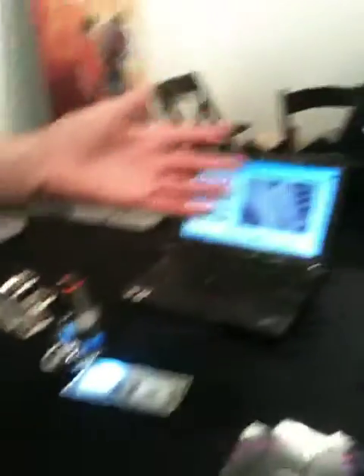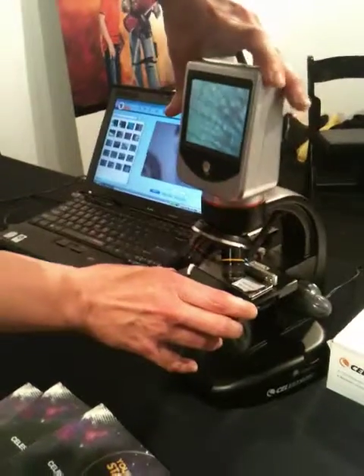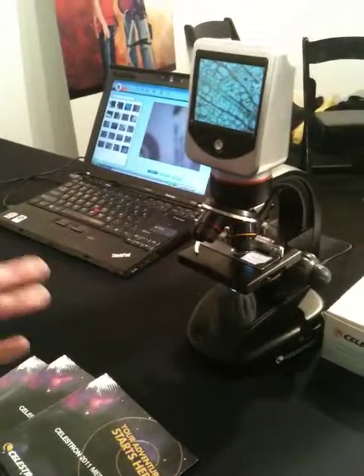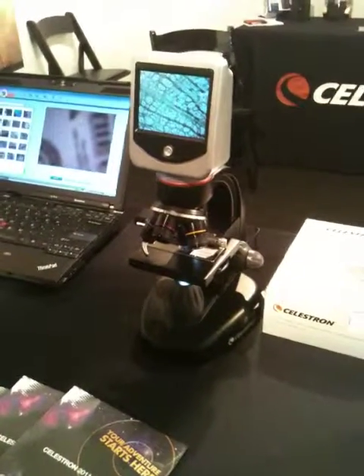And then here we have our LCD deluxe digital microscope. It has a rotatable screen, four objective lenses, goes up to 1,600 times power — great for slides, hobbyists, classroom — and retails for $299.